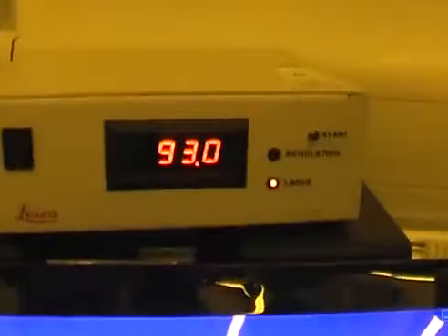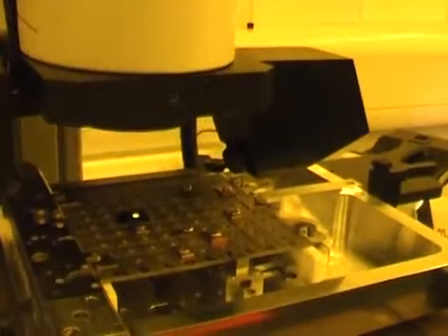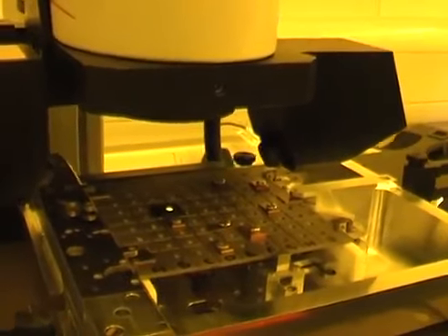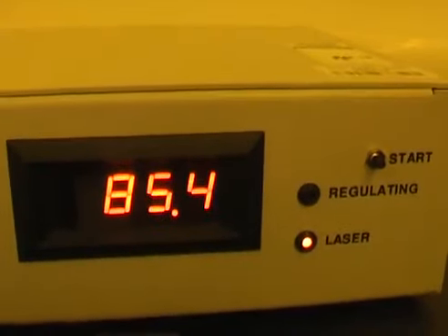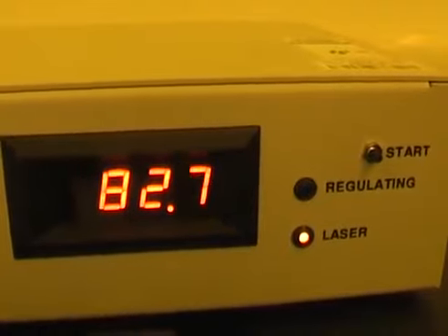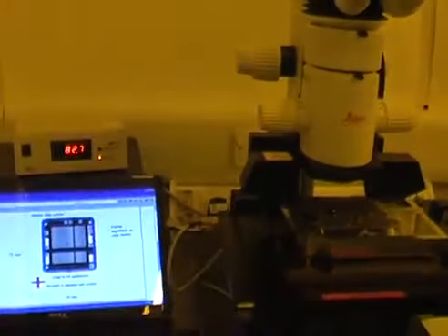Final check, let's have a look in the Y direction. So I'm going to put it more into the middle of the sample and then do the Y direction. And the tilt in the Y direction is much, much less. If you notice that. It is moving, but not so much. So there's two issues, and it needs to come out and be readjusted.